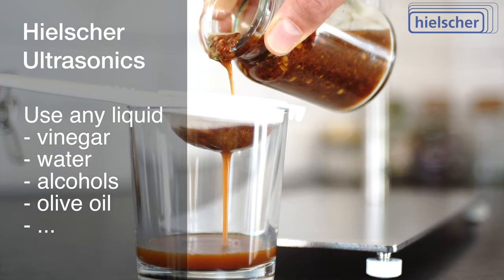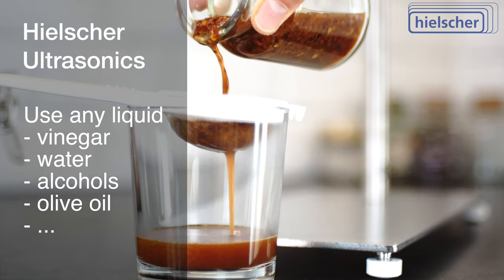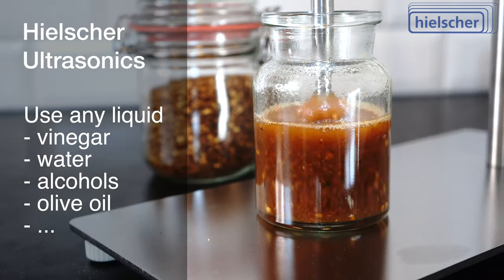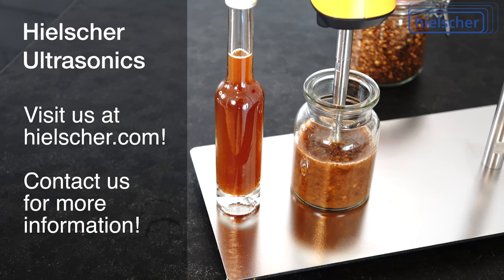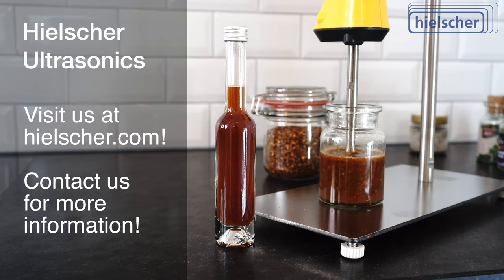Then you separate the solids from the liquid by decanting, centrifuging, straining, or filtering. In this way you can produce your own high-quality herb and spice extracts in a short time. Visit us at hielscher.com or contact us today for more information.